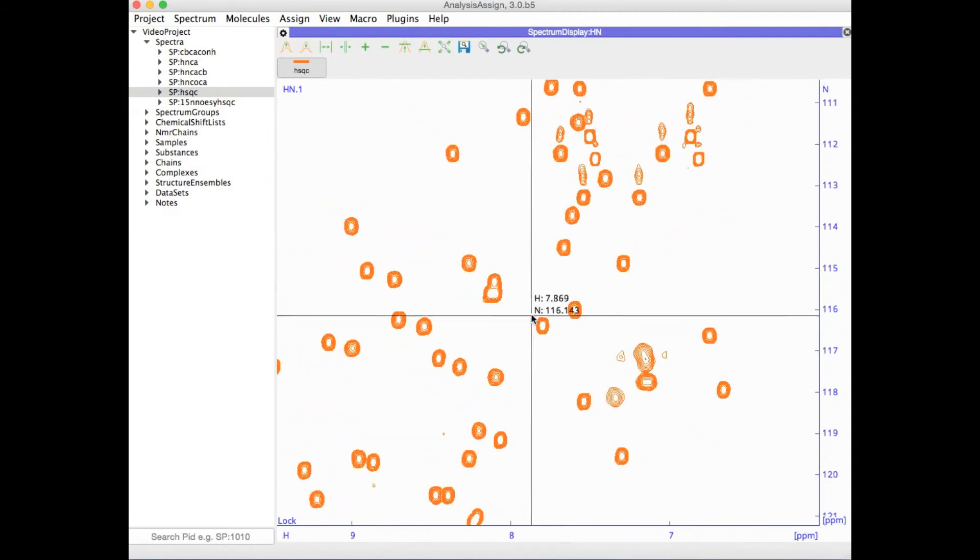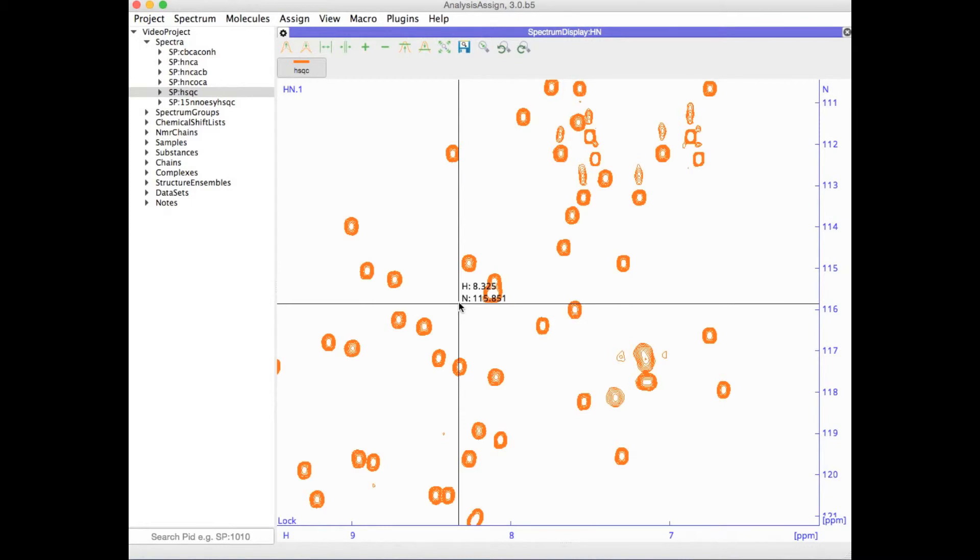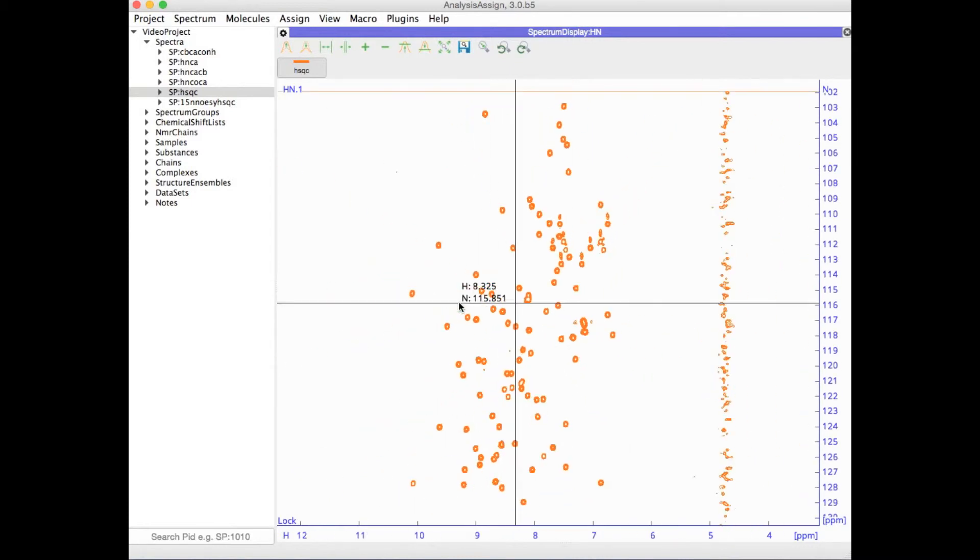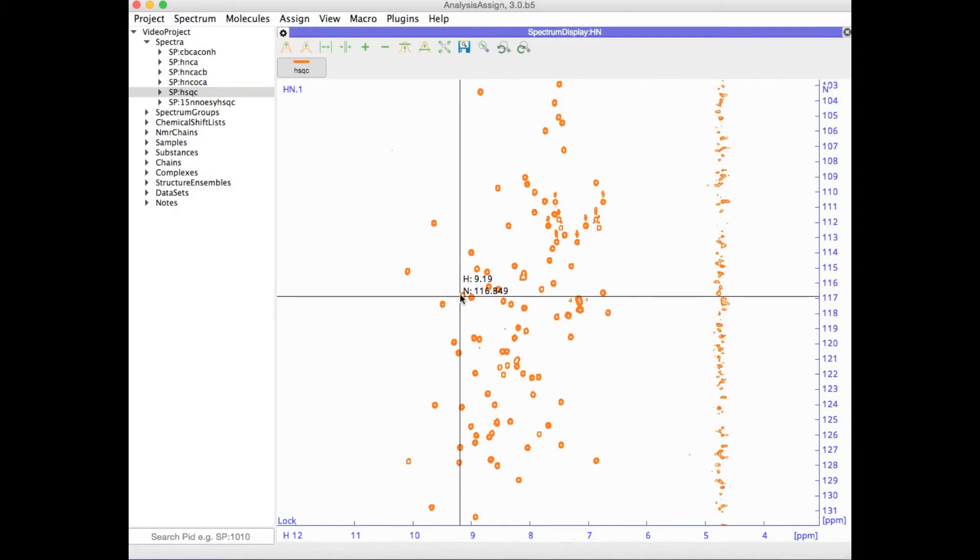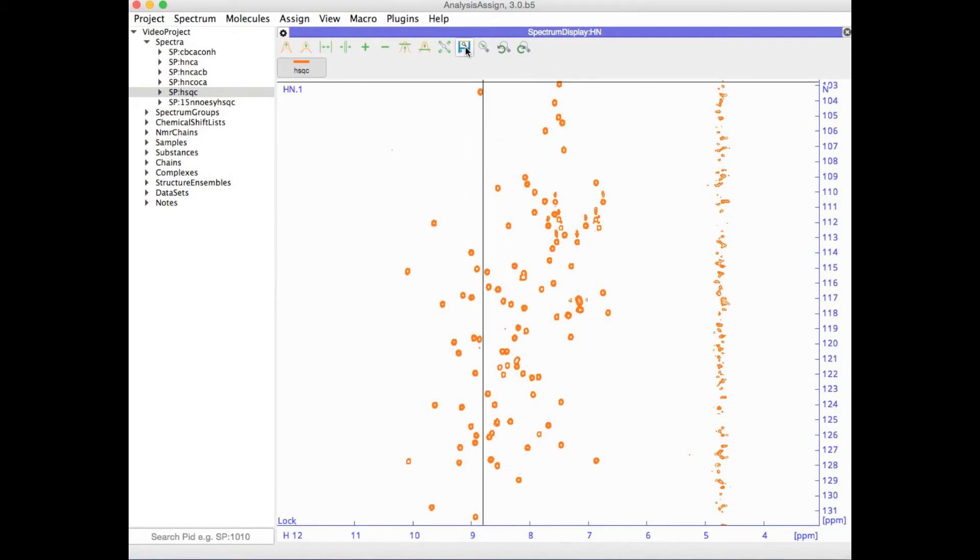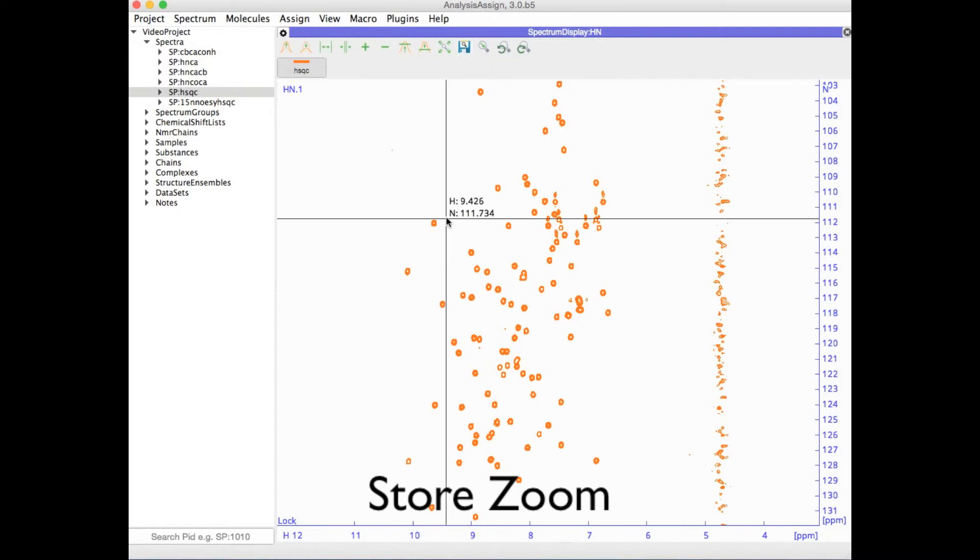You can also store various zoom levels. For instance, you might like to store a nice convenient view of the full HSQC. Simply click on store zoom in the toolbar or you can use the keyboard shortcut ZS.